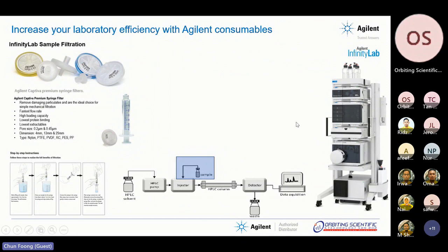If you are using an HPLC system or a column with a sub-2 micron particle size, it is advisable that we use a 0.2 micron pore size syringe filter. For other common filtration, you can use 0.45 micron syringe filters. Also, there are many types of syringe filters such as nylon, PTFE, PVDF, regenerated cellulose, all those things.